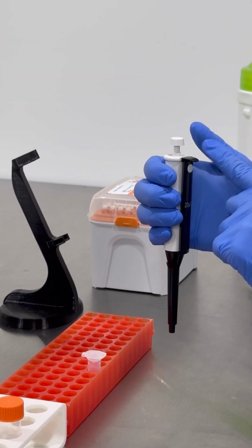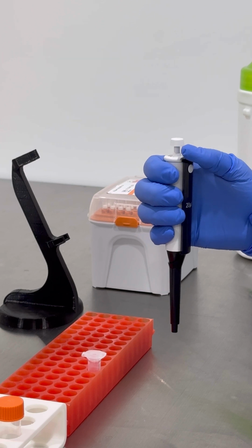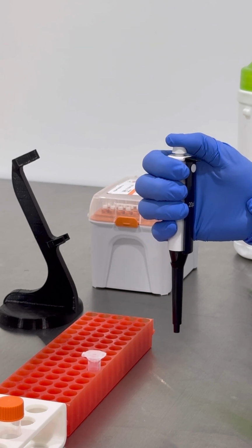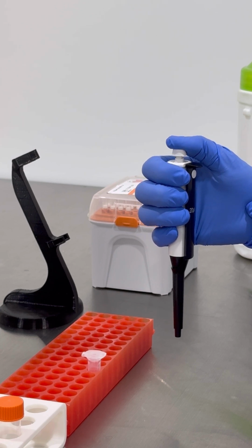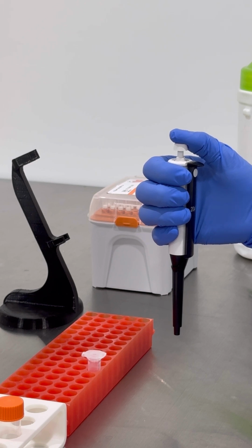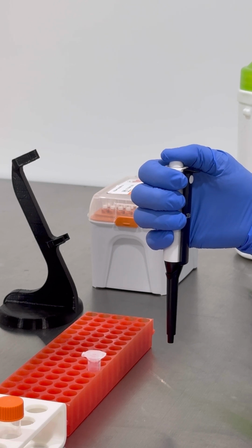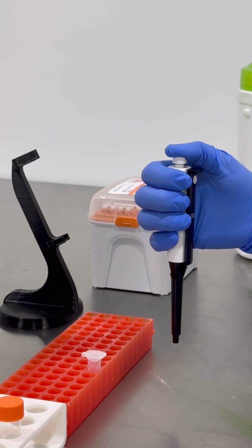Hold the micropipette in a vertical, upright position during use, in either hand with the black tip ejector facing your thumb. Practice pressing down slowly on the white button on the top of the micropipette to the first stop. Hold for 2 seconds and then release the button upwards slowly. Then practice pushing on the white button slowly to the first stop and then pushing slowly further to the end, the second stop. Hold for 2 seconds and then release the button upwards slowly.